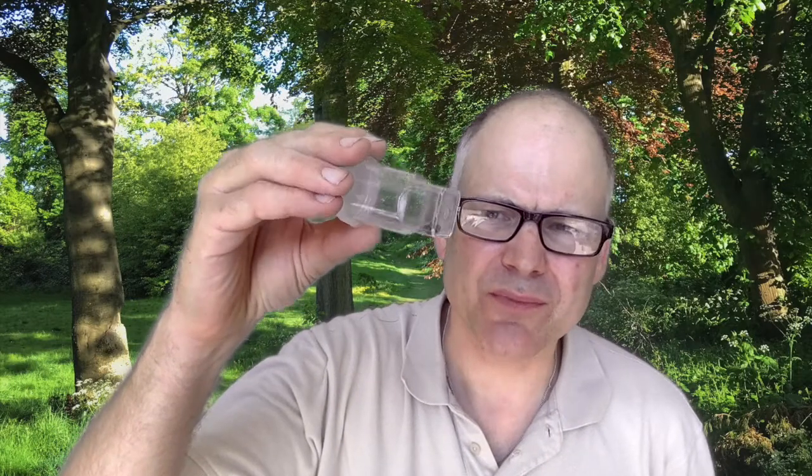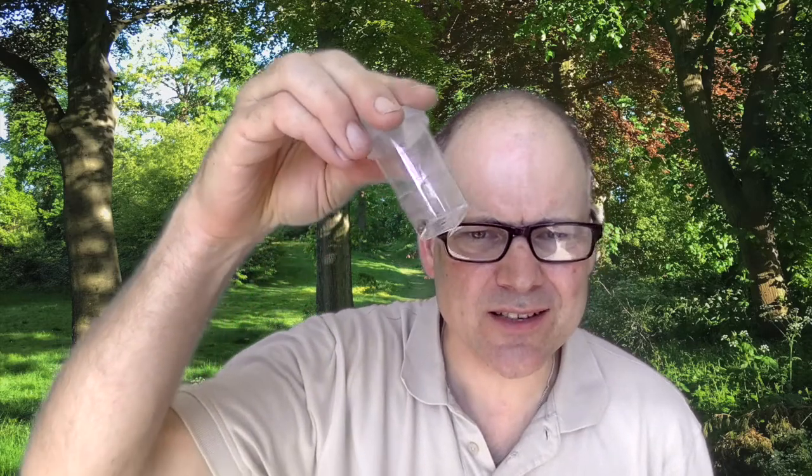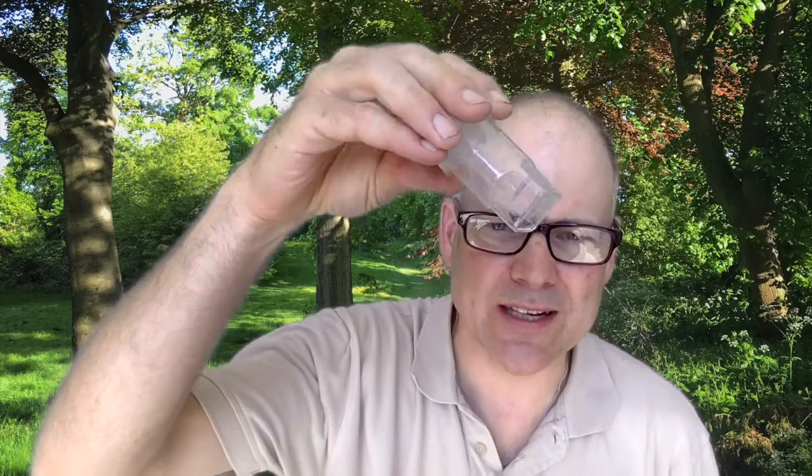I've actually got here some dead flies and dead ladybirds. So I didn't kill them, they were already dead when I collected them. But again, let's see if the microscope can show us some of the structures on these insects. Okay, so first of all, we're looking at the fly, and you can see it's actually quite hairy, and you can also see its eye to the top left of the picture. And its eye, of course, is a compound eye. It's got lots and lots of eyes. That's the fly's wing. And then the fly's body, again, lots of hairs moving down its legs as well.